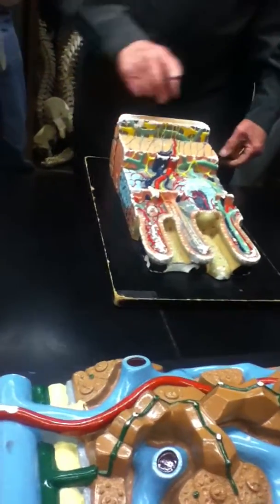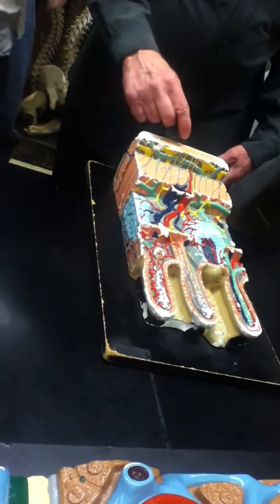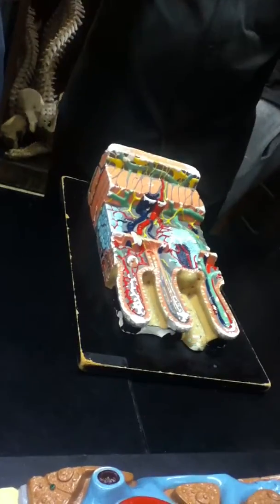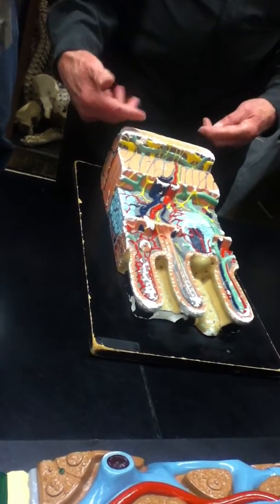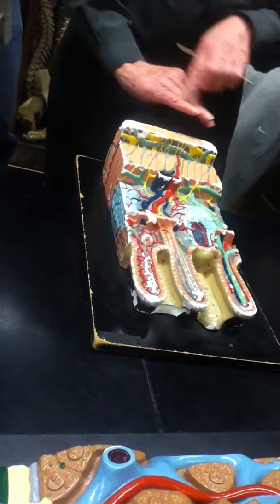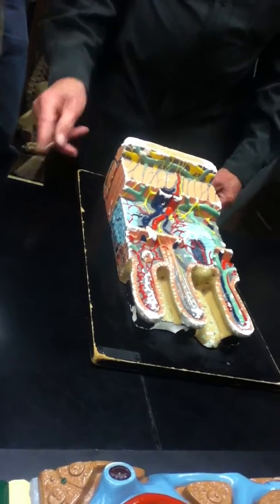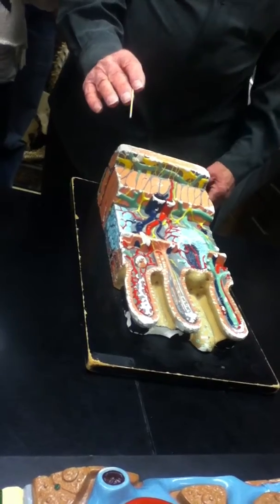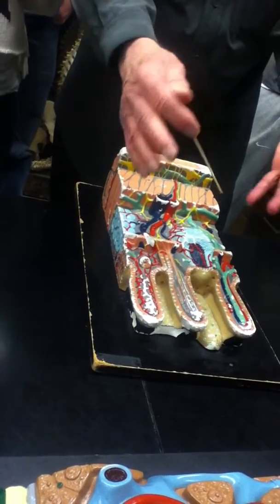Let's work our way this way. Here we have muscle that runs the length of the intestine, so this is longitudinal muscle. It's thinner than the thicker circular muscle. So you cut the circular muscle fibers this way, and you cut the longitudinal muscle fibers this way. So we can dispose of those very nicely. The yellow things that you see here are part of the nervous system. I'll get back to naming those for you as we go in this direction.